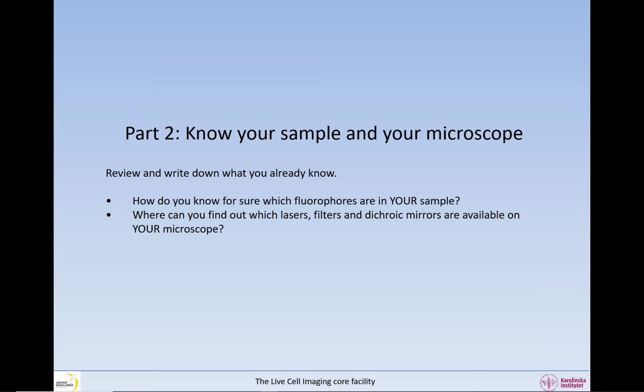How do you know for sure which fluorophores are in your sample? And where can you find out which lasers, filters, and dichroic mirrors are available on your microscope? Okay, so write down these answers and then start the video again.